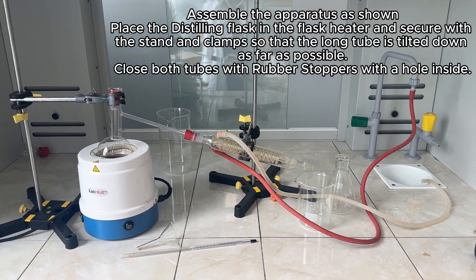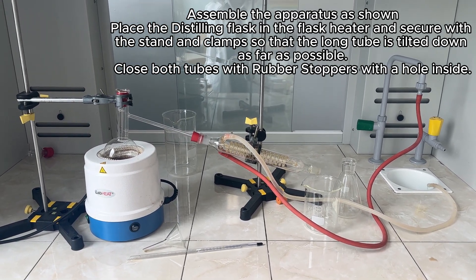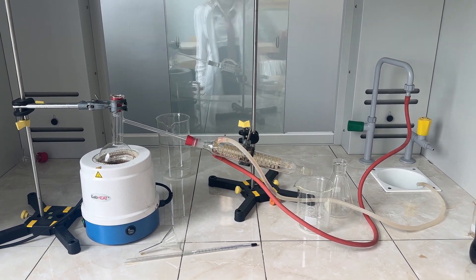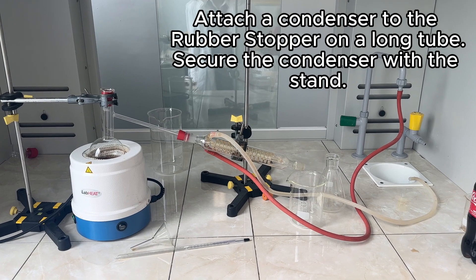Assembly apparatus as shown. Place the distilling flask in the flask heater and secure with the stand so that the long tube is tilted down. Close both tubes with rubber stoppers. Attach a condenser to the rubber stopper on the long tube and secure the condenser with a stand.